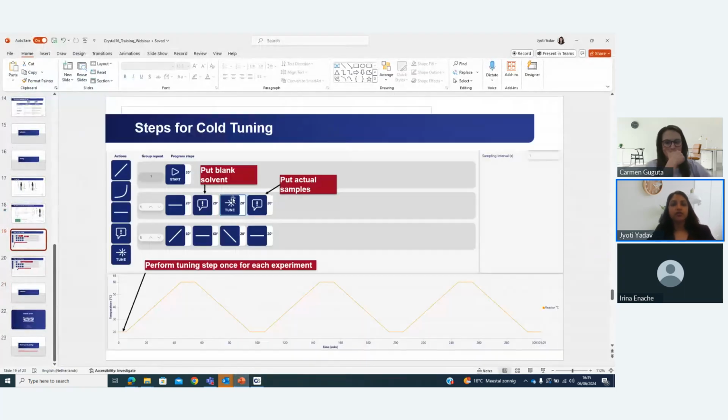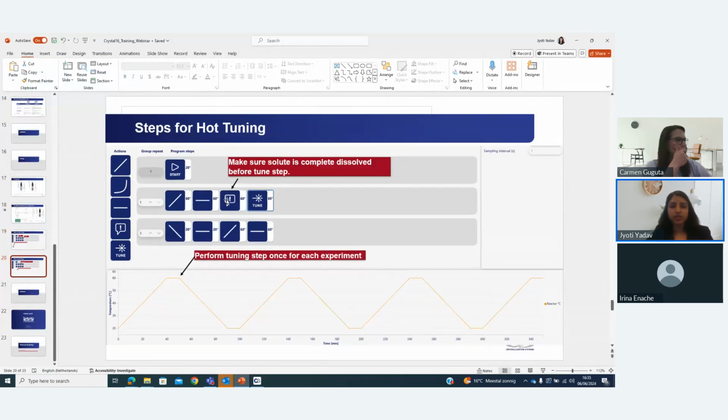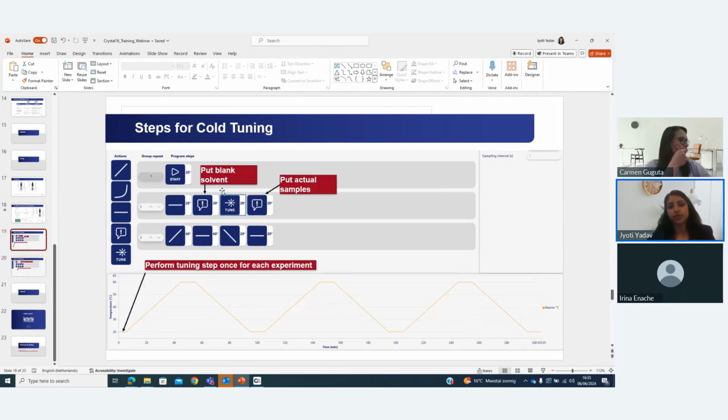Yes, if you are increasing your temperature and everything is not clear, you should not click continue during the prompt step, and keep it running at the same temperature for a longer duration. And if you are still not able to tune your system, maybe you can go for cold tuning as well. That is for a longer time, and even visually look at the vial, take it out fast, put it back, and keep it longer at that time. Mixing is also important.